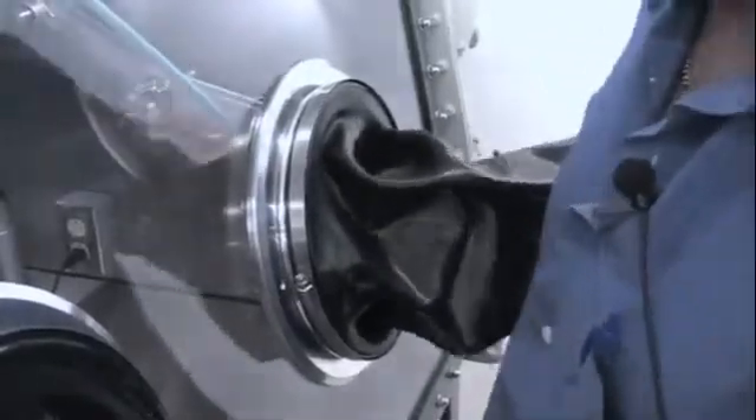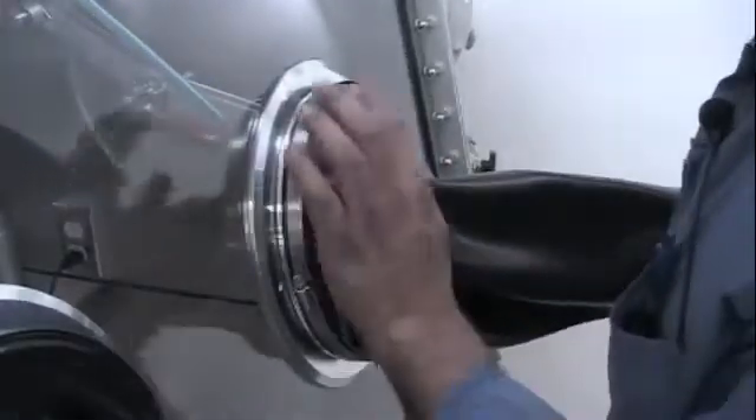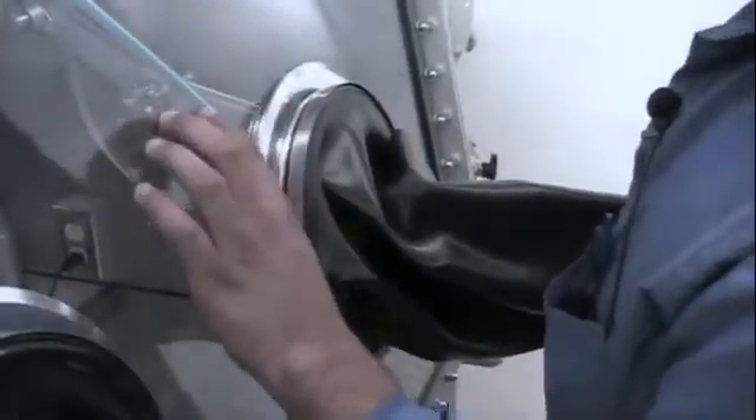It's all nice and tight. This will allow us to remove the glove without compromising the glove box's atmosphere.